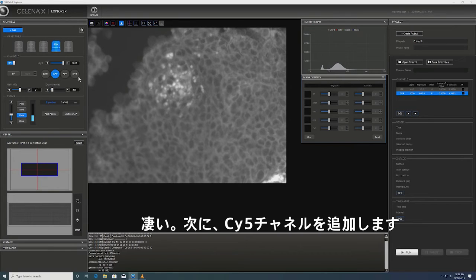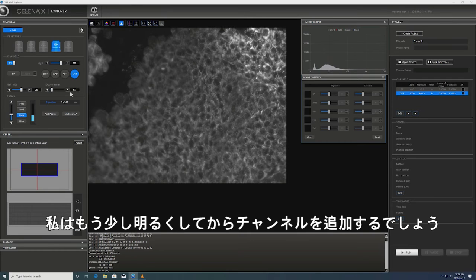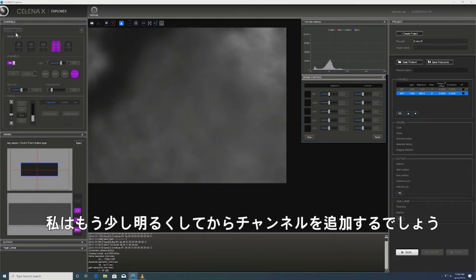Great. Now we're going to add Cy5 channel. Maybe I will make it a little bit more intense and then add the channel to it.